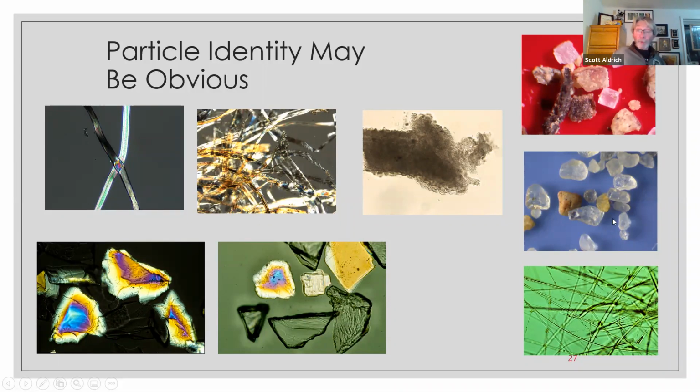The image with the blue background is an example of beach sand, and freshwater sand at that, because it doesn't show the sort of foraminifera and other sort of organism shells that ocean water would have, diatoms, things like that. Bottom right, fiberglass, characteristic, very fine strands of glass with the glue that holds them together.